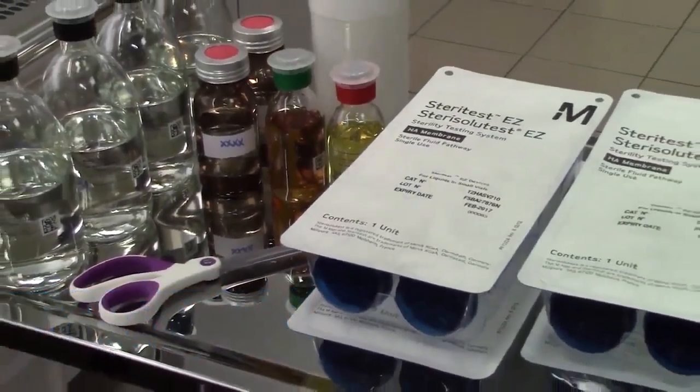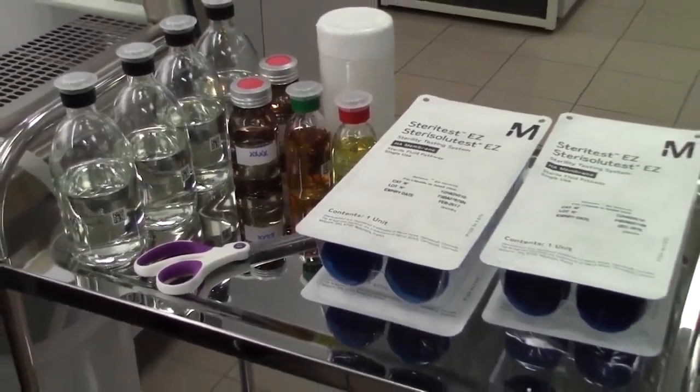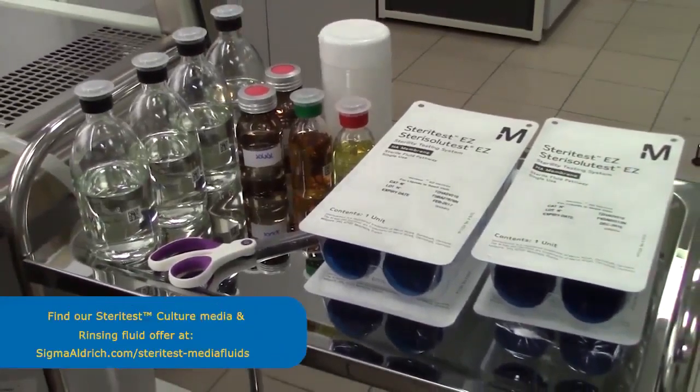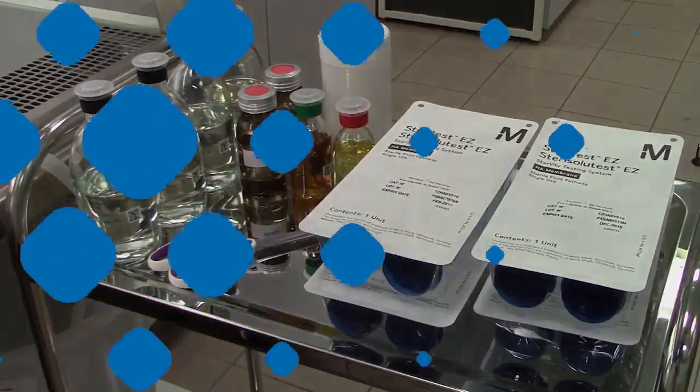Sample whose volume and quantity are determined according to pharmacopoeia and specified in the SOP. Tryptic soy broth for aerobic bacteria and yeast and molds. Thioglycolate for anaerobic bacteria. Scissors. Surface decontamination wipes.